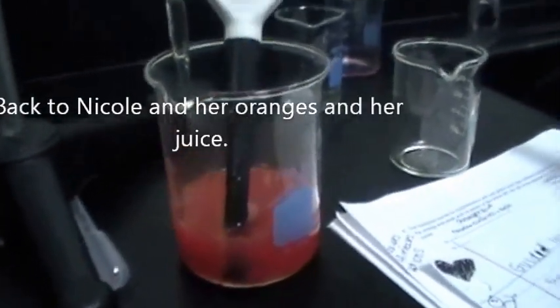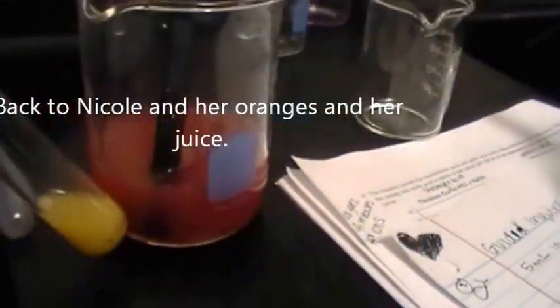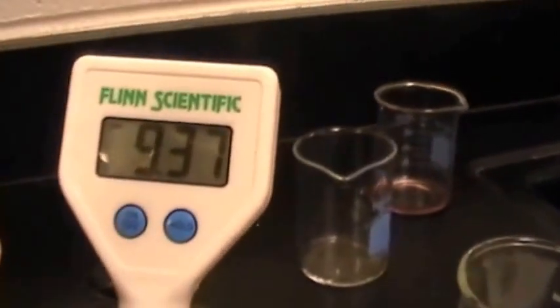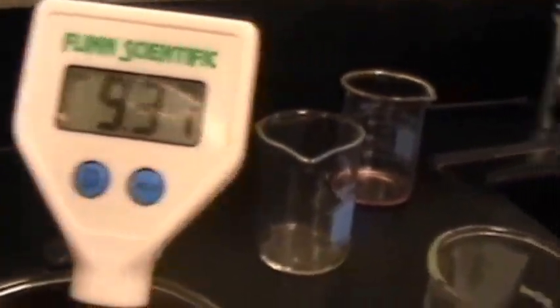So if you look closely, we can definitely tell there has been a major color change compared to the original orange juice. Now we're at a slight grapefruit. We still have quite a lot of titrant to go through. We are at 9.36 on the pH.